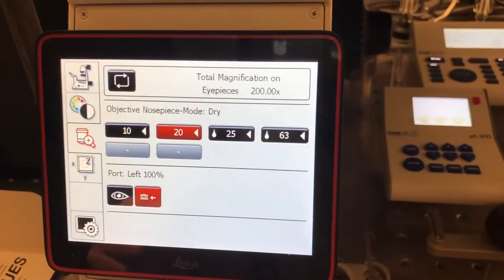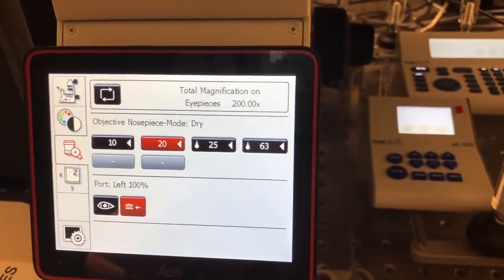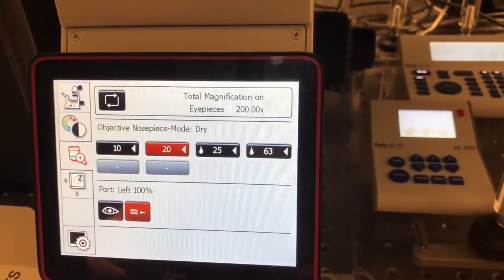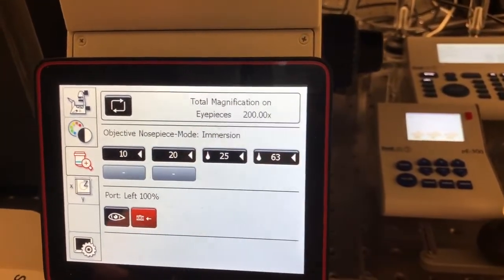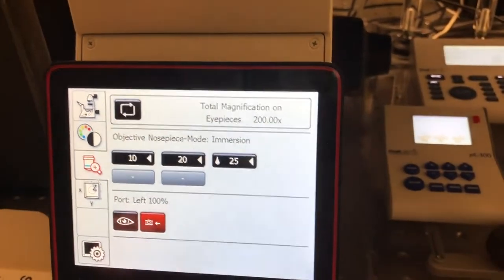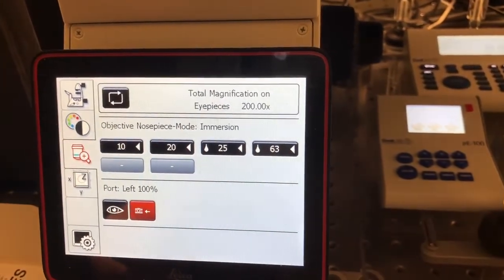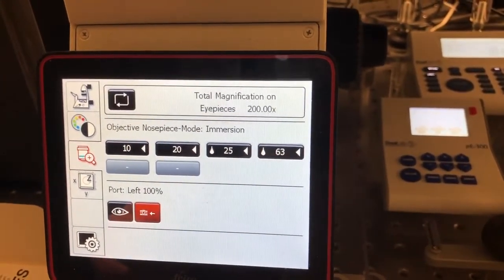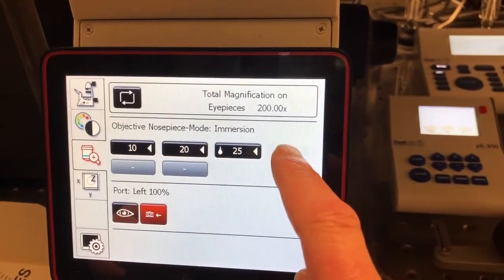If you are changing between an air objective and an oil objective, if you press the corresponding button for the oil objective, you can see that it will blink, and it will only change objectives once you press it again.